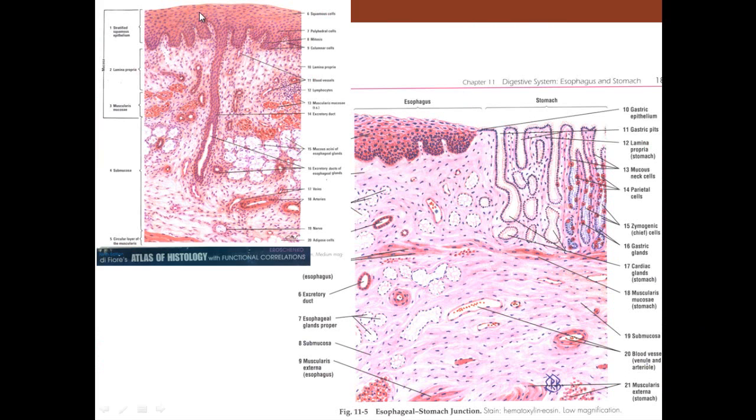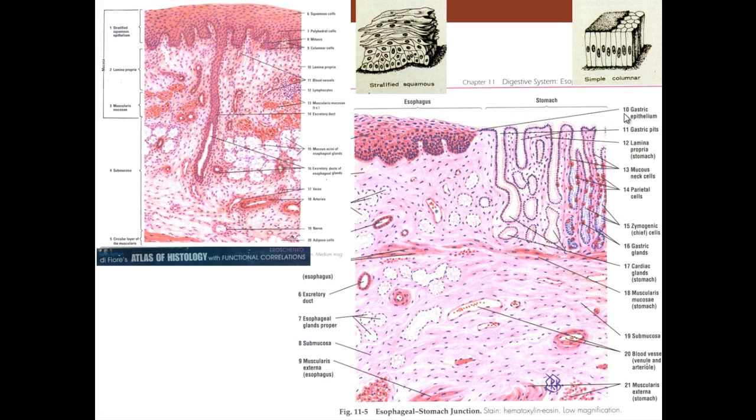So you come out from the esophagus with stratified squamous epithelium and get to the stomach, and the epithelium changes. From stratified squamous epithelium, the very same type as we had in skin, other than it's non-keratinized in the esophagus, to simple columnar. So we'll keep simple columnar all the way through the GI tract, and you will have different cells in different regions.